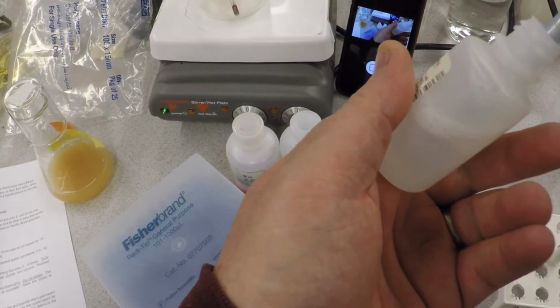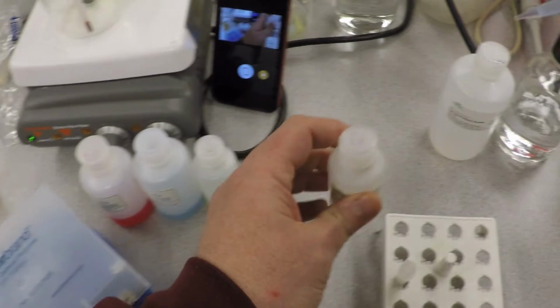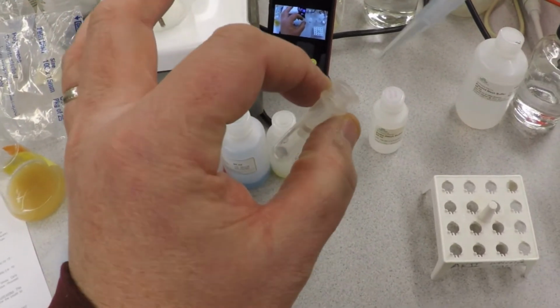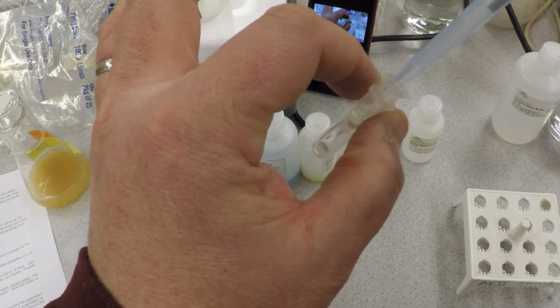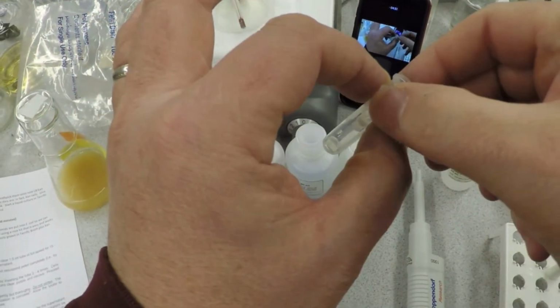And lots of salt and stuff, I think. 200 of this. And what it says is 200 and spin the column. So when you're adding this, you just put it in here and just drop it right in over the column. Just like that. No fuss, no muss, nothing exciting. Don't pipette up and down, just drop it in there.